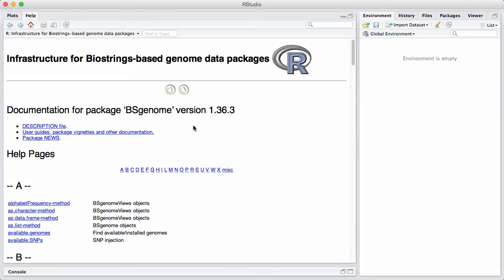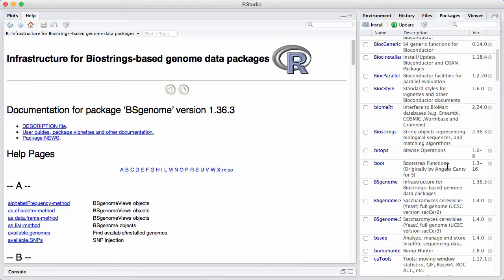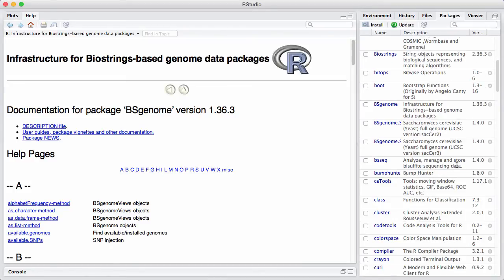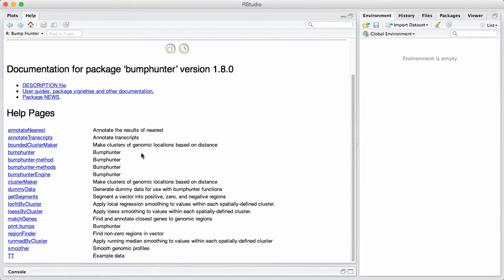You can also get to this package vignette list a little bit easier in RStudio. In RStudio we have this panel, in this case in my setup I have it over to the right, that's called packages. I click on packages and these are the packages that I've installed. And if I click on it, say bumphunter, I get taken to the help page for the package again and I can navigate down to the vignette.